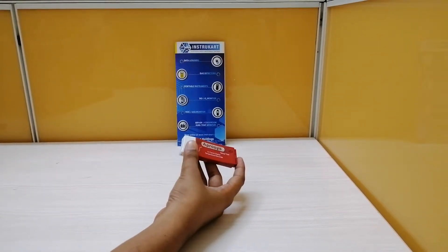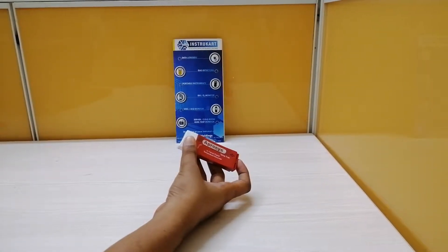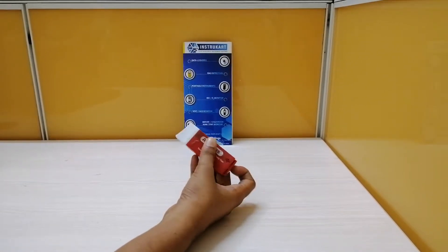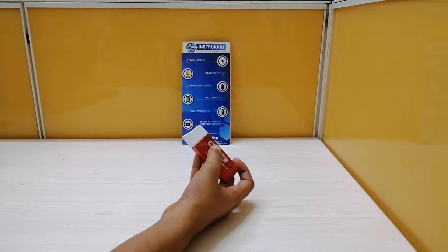It has a sample rate of 20 minutes, which is fixed and cannot be changed. The suggested use from the manufacturer is 50 to 99 days.